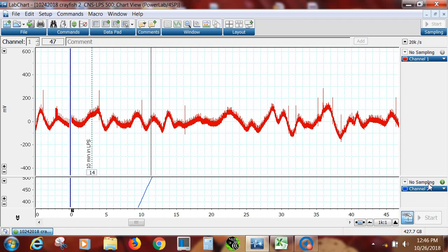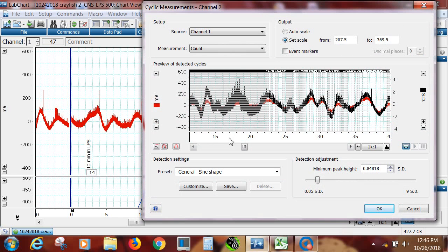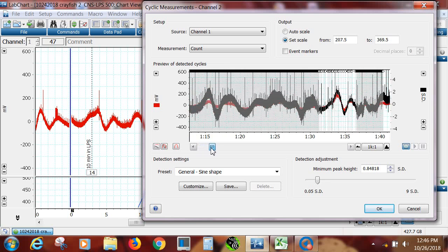So when you zoom in, when you're doing your analysis down here, you have to watch out what frame you are in. So that says 15 and 20, and it's right here where we are in this file. But if I went way back over here, there's 15 and 20 again, but we know that's the saline. So watch out for that when you're doing your analysis.